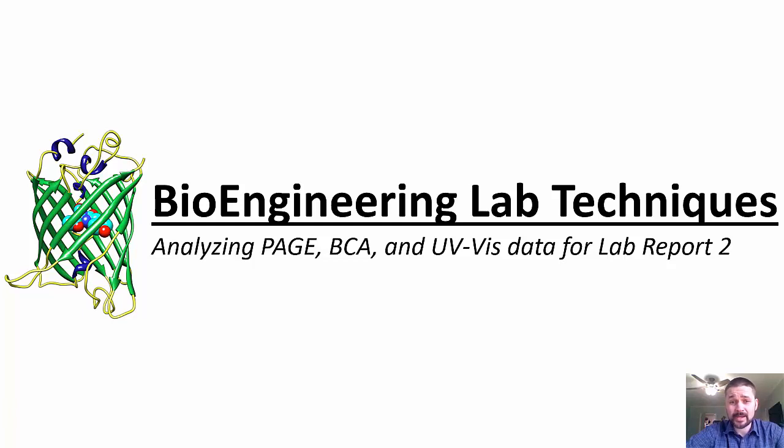Hey everybody, welcome back. I just wanted to put together a quick video here to explain how you should analyze the data from our last lab there in Module 2, where we collected all that BCA data, ran a PAGE gel, and looked at the UV-Vis spectra of your purified proteins, because there's a lot to walk through there and a lot of chaos to sort out as well. So anyways, without any further ado, let's get started with that.